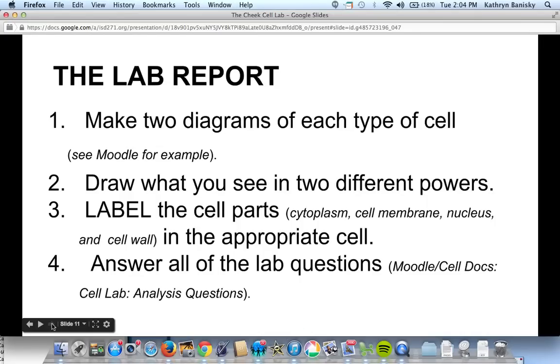You need to submit a lab report. There's an example on Moodle showing how to make diagrams for each cell. You need two powers for each cell: for the onion cell, a drawing in low power and medium power; for the cheek cell, medium power and high power. Use your own original drawings created through the Google drawing tool, and use labels for all parts you can see. In the onion cell, expect to see cytoplasm, cell wall, nucleus, and cell membrane. In the cheek cell, expect to see nucleus, cell membrane, and cytoplasm — but no cell wall.